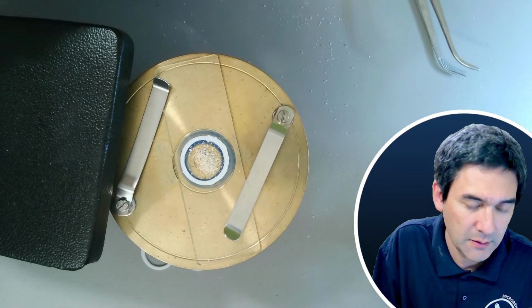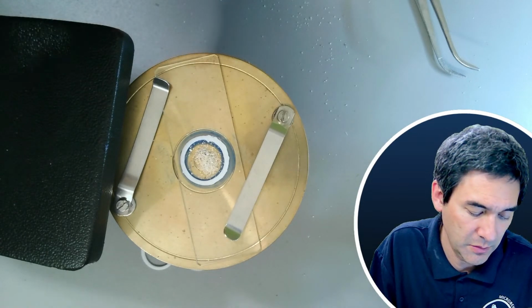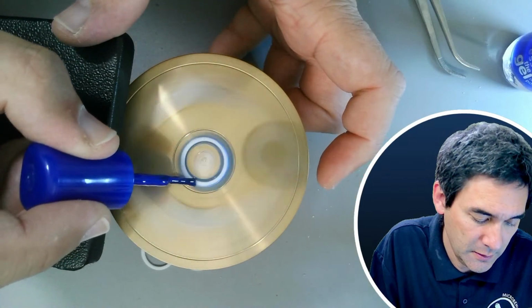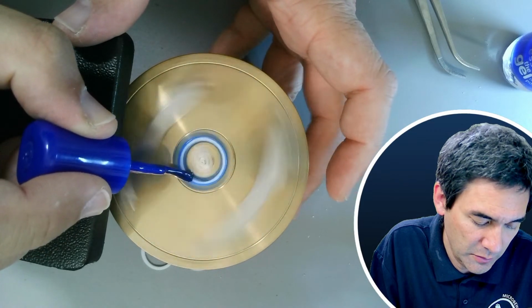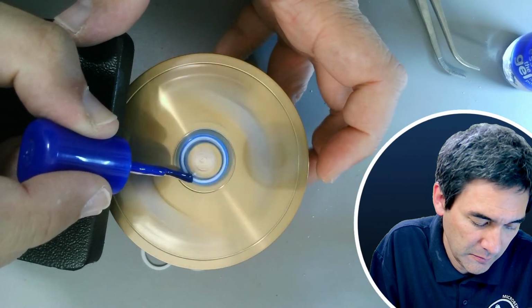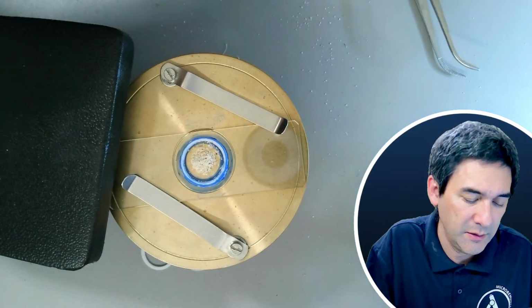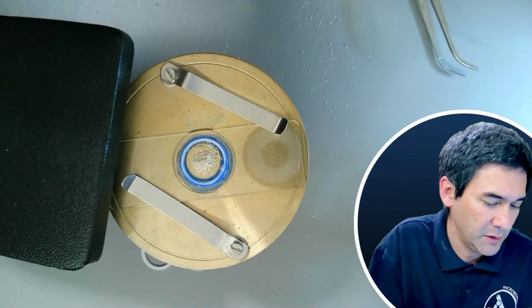Okay, if this works, I don't know. Maybe I'm going to use a little bit more of the, and yeah, not so good yet. Okay, this is not very liquid, I just realized. So maybe the other one is a little bit better.